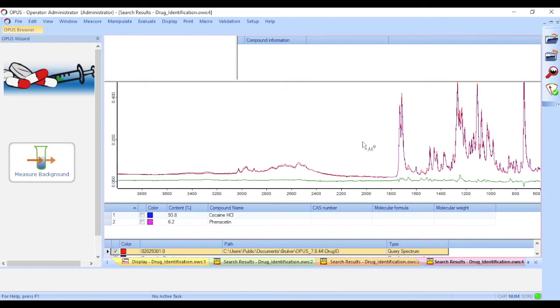It's important to note here that these percentages refer to the proportion of signal in the spectrum. But according to physics, and specifically the Beer-Lambert law, we can make the assumption that these percentages are representative of the sample because light absorption is directly related to the chemical makeup of the sample.